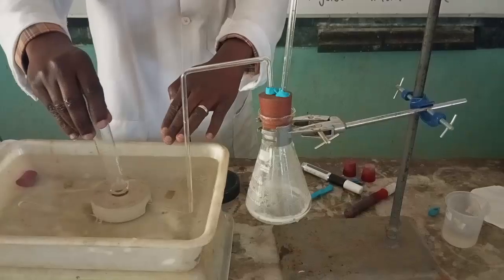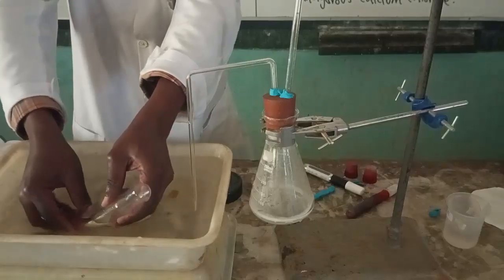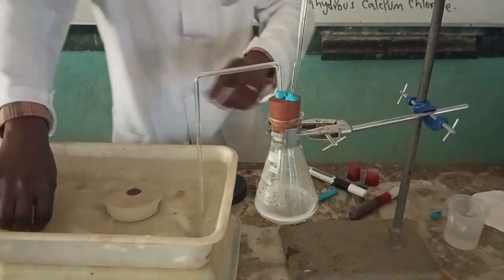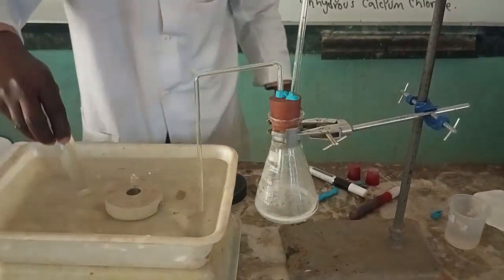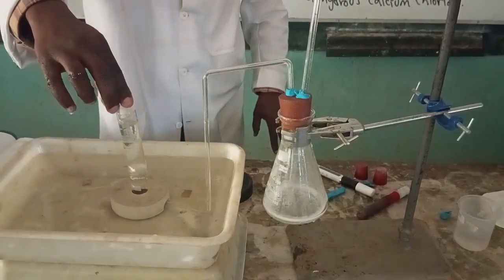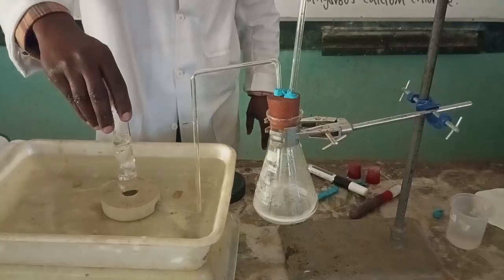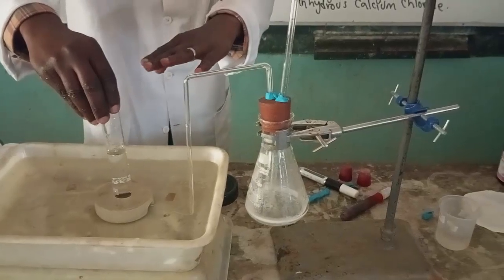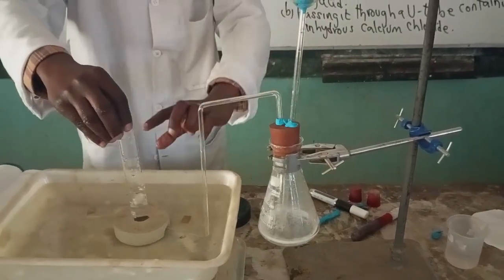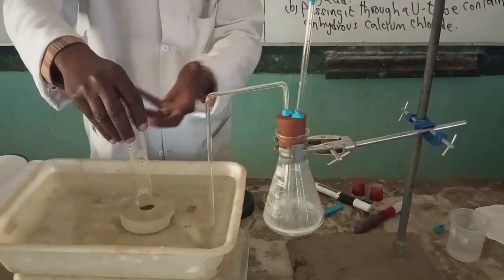So the first boiling tube is full, so I cork it, I place it on my rack. We get another boiling tube full of water. We collect more. This will be used for our subsequent experiments. So let's collect more hydrogen. We are displacing the water. The hydrogen that we collect, we call it wet hydrogen, because it's collected using the overwater method.